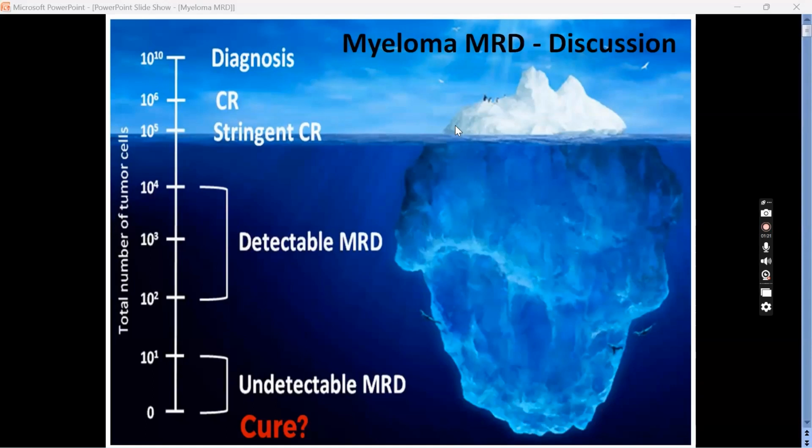When I asked for opinions, there were some related to AML MRD. Now, if I want to take AML MRD, it is not that easy. First of all, it is more complicated than B-MRD, T-MRD and myeloma MRD. Second, opening it up is like a Pandora's box, and I'm sure you will not understand it; in fact, it will raise a lot of confusion.